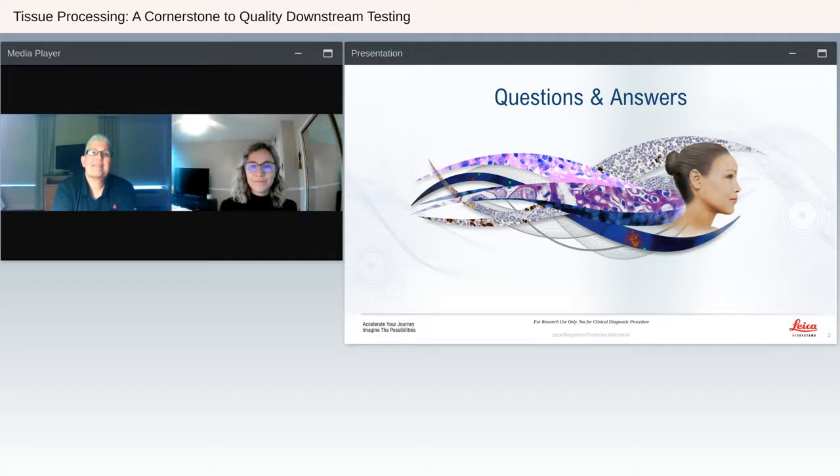Great. And if it's okay with you, we do have a few more coming in. Sure, absolutely. One of these says, how long can you leave samples in the embedding center before loss of tissue quality? There's nothing written in stone about that. Usually, and I've actually reached out in the field to see what the consensus was, and most felt like it would be ideal if it can be in the embedding center less than 45 minutes to an hour.